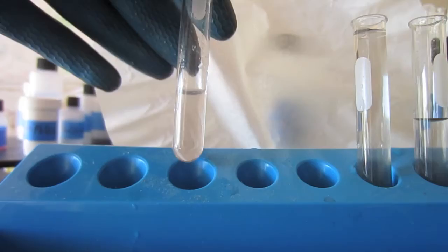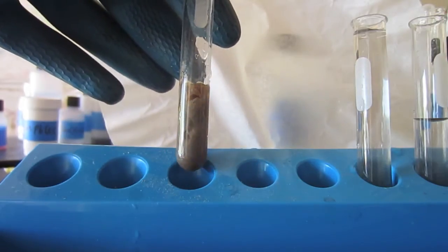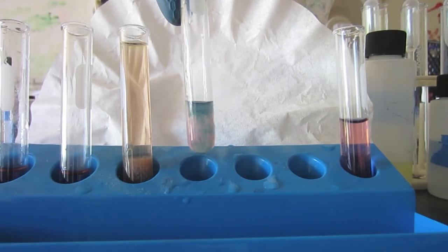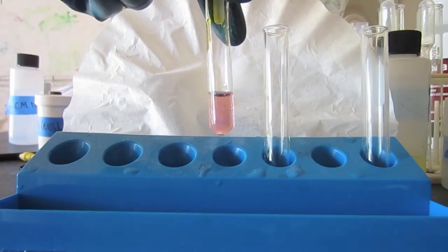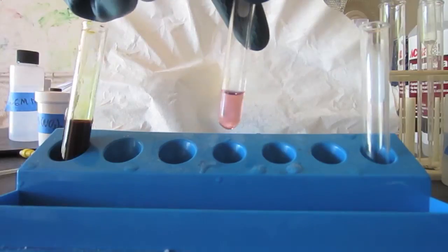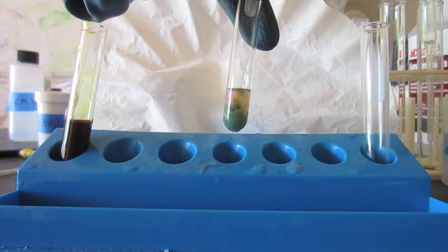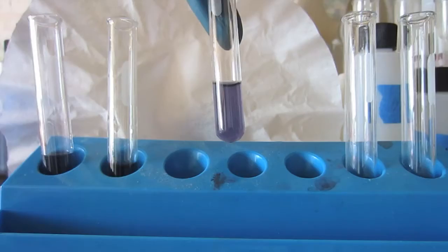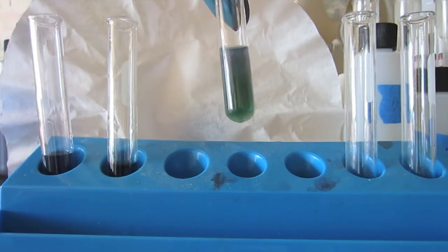Well, doing experiments from a do-it-yourself home lab, no-lecture chemistry book written by Robert Bruce Thompson, it's called Illustrated Guide to Home Chemistry Experiments. I came across an experiment that I thought was particularly cool visually, and I thought it would be great to post it on YouTube.